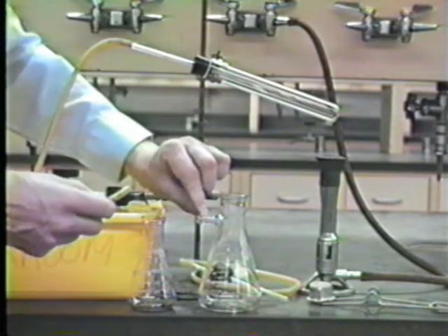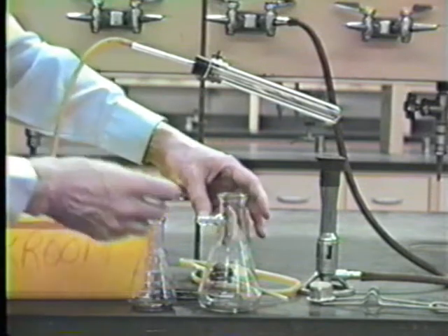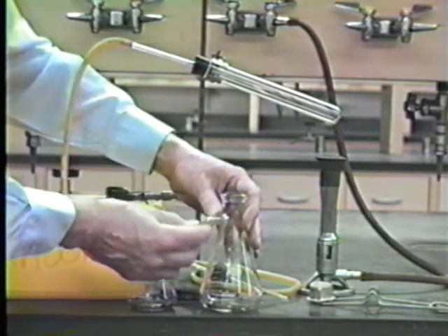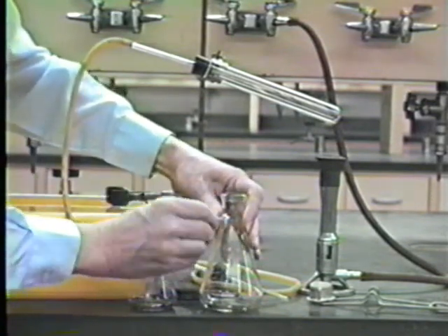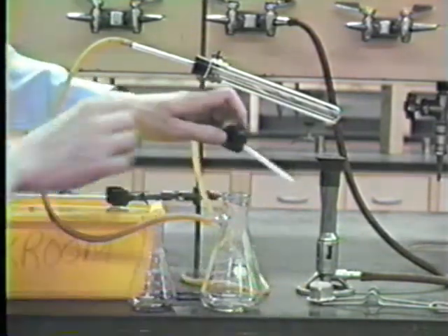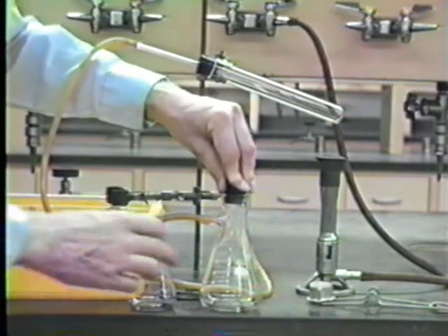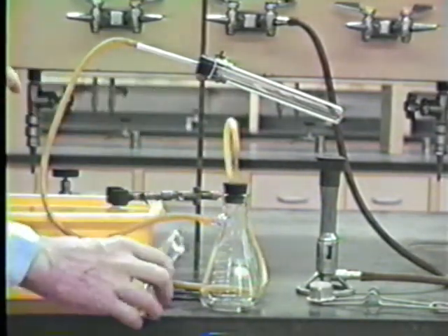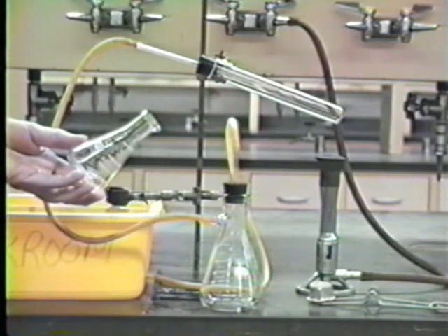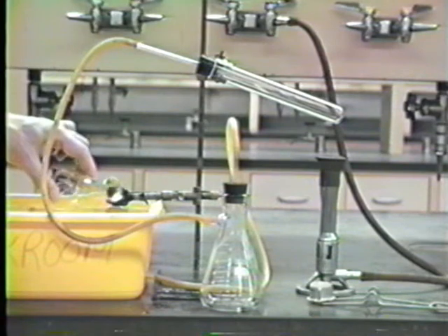When you're putting rubber tubing on glass tubing, make sure that both of these are wet, and then the tubing will slide on much easier. And finally, what you'll do is you'll put in this tube, which will lead from the reservoir here into your collecting flask. Your collecting flask is a 125 milliliter Erlenmeyer flask.